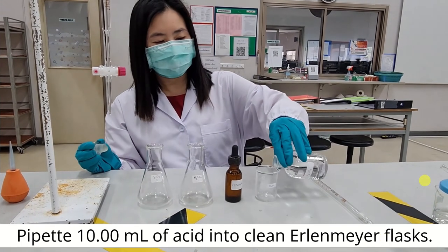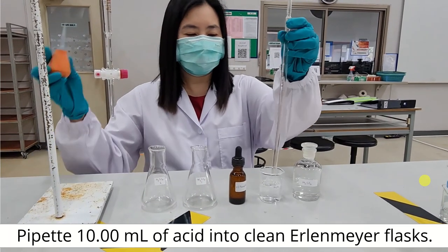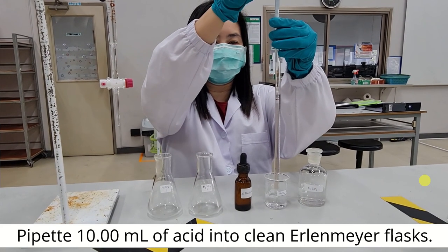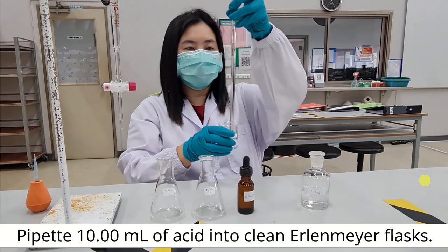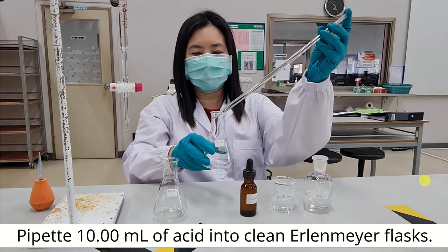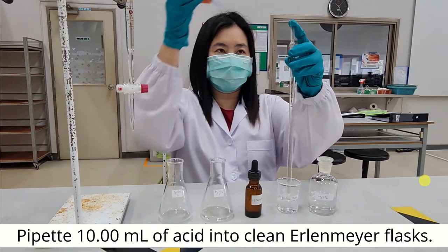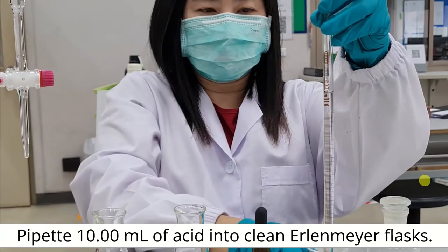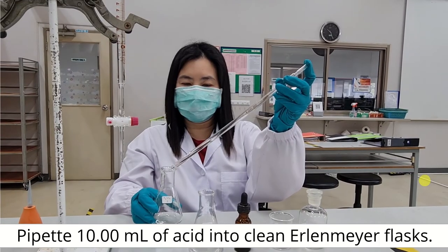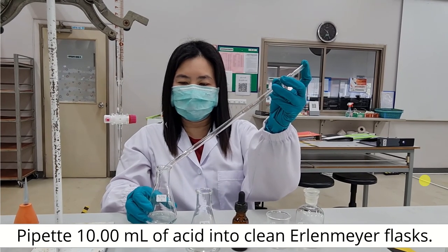Okay, start by preparing samples. Pipette 10 ml of acid into a clean conical flask. You need at least 2 trials, so prepare 2 flasks. Let the liquid flow nicely into the flask. Do not blow the pipette.